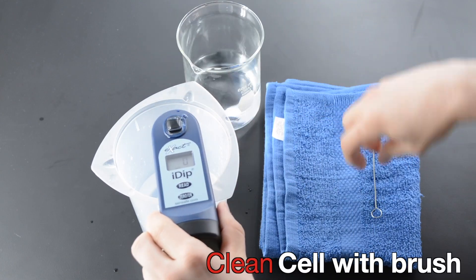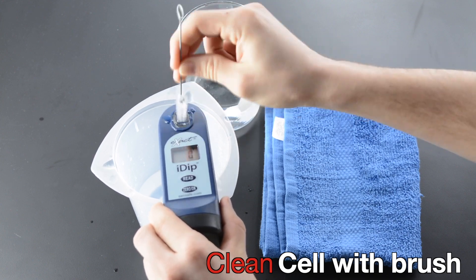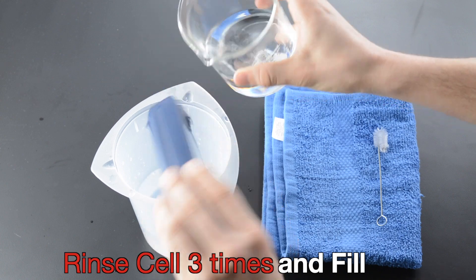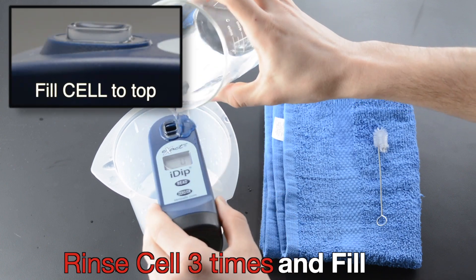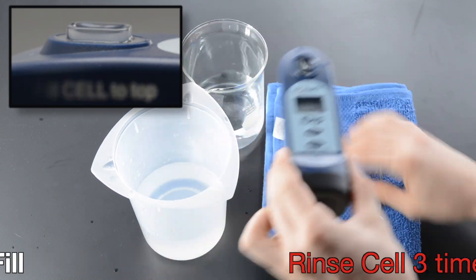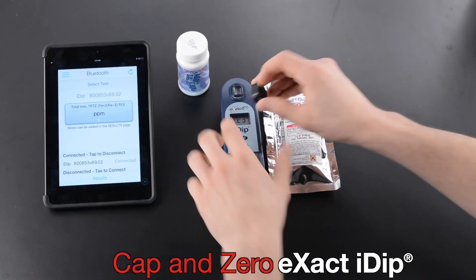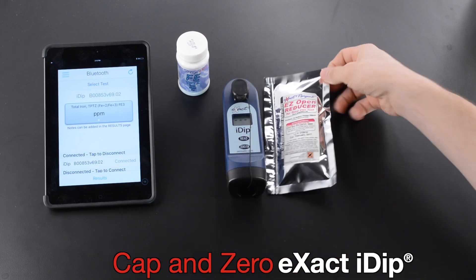Clean cell with brush. Rinse cell three times and fill. Fill cell to top. Select Test. Cap and Zero XactiDip.